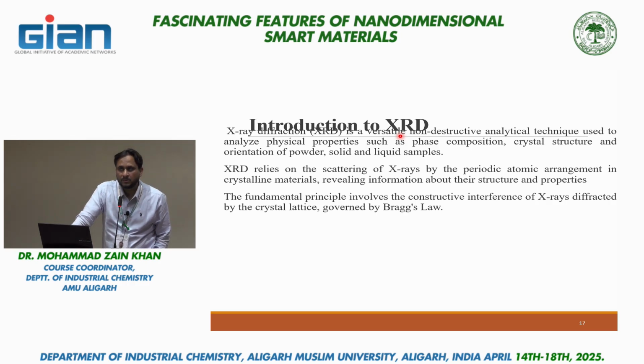XRD relies on the scattering of X-rays. When they fall on the solid, they are diffracted in different directions. And when you visited yesterday, you were given a demonstration of two types of X-ray. One was PXRD, powder X-ray, which is very useful for nanotechnologists and material science. The other is called single crystal X-ray.